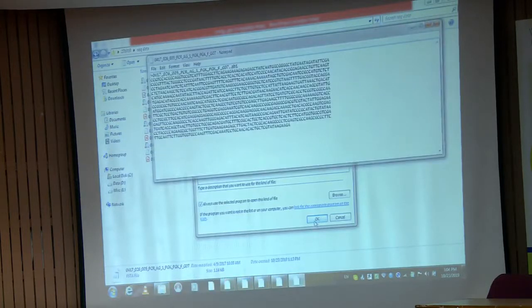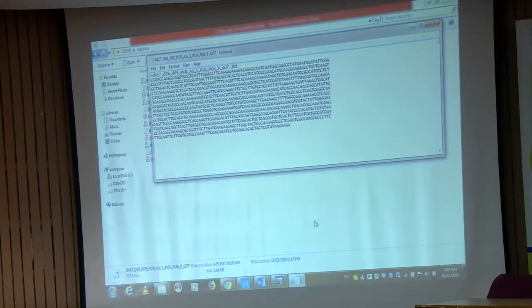So, this will be your FASTA file. The company people will say that this is the FASTA format of the sequence, this was your sample name, this was your primer name, PGK forward. And this is the sequence which the company is providing, but never ever go forward for the analysis with this FASTA format, because they are saying that this is CGT, but how good that particular base is, you do not know, right.